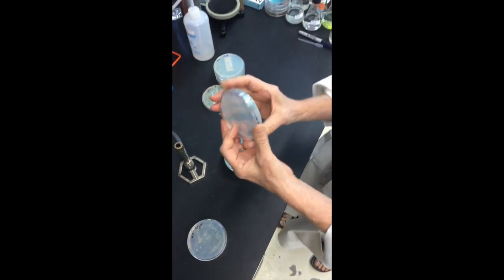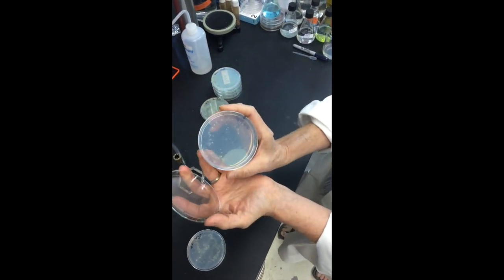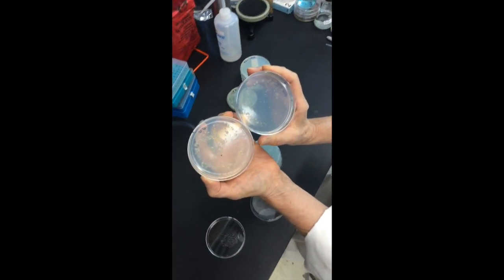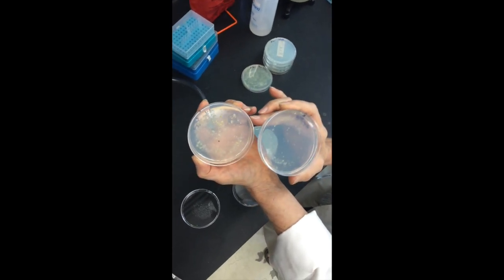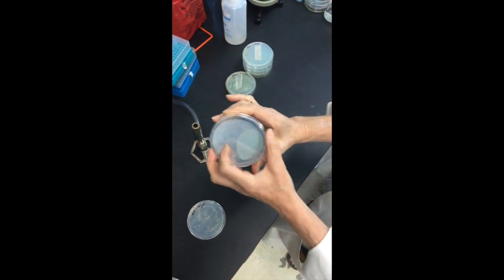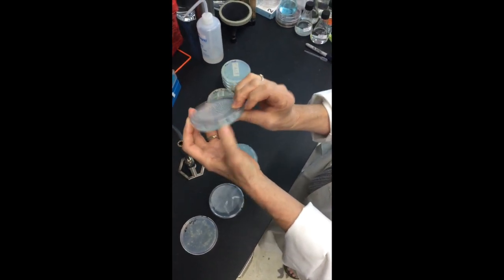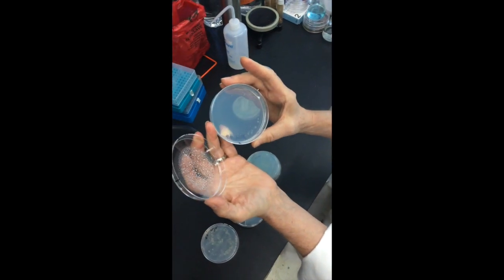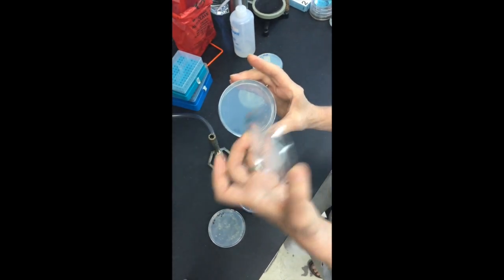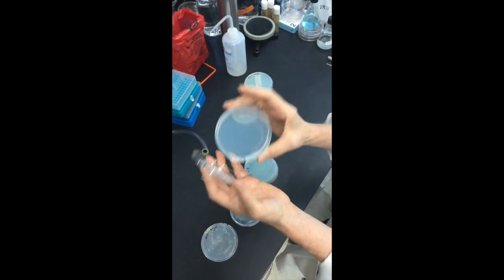So this is the plate that had 0.5 millimolar copper in it, and you can see that there are quite a few colonies on there, but they're not as many as on here. So that means that many of the colonies that grew on the original plate could not grow on 0.5 millimolar copper. Now if we go to the next one, this is 1 millimolar copper. You can see there was the 1, and we have even fewer colonies that can grow on this. So those are cells that give rise to colonies on this plate, but that means that they're still resistant to 1 millimolar copper.